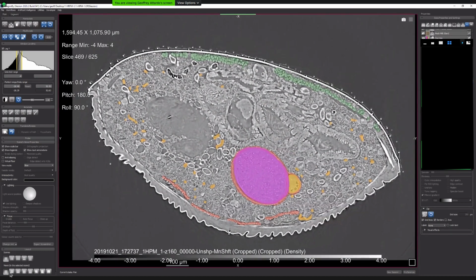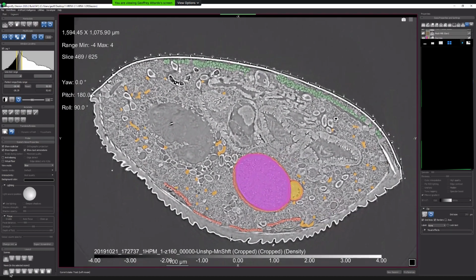Yes, I see. It's quite an old video we did maybe 2 years or 1.5 years ago. And we don't recommend that anymore because we have a better solution. That's what I'm going to present today, the Segmentation Wizard. We never extract the marked slices anymore because that's not the best way to do deep learning. Ah, all right. Yeah, right.